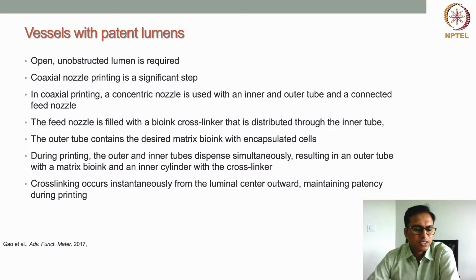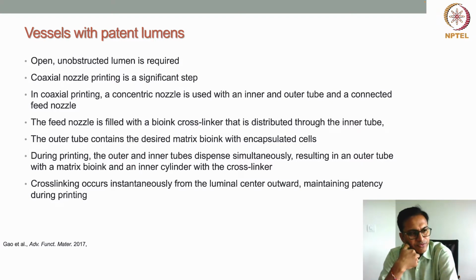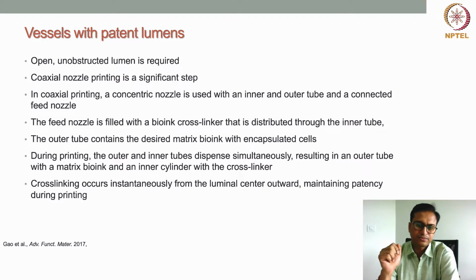Here, generally coaxial nozzles are used. Coaxial means concentric nozzles, with an inner core and an outer channel in the same nozzle, where two different materials can be simultaneously pumped or extruded through the inner compartment and the outer compartment.